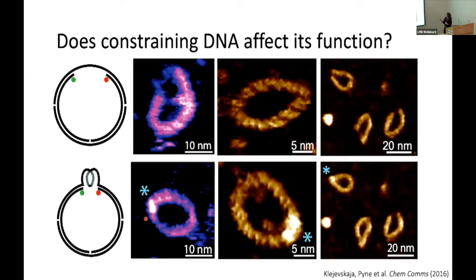But when we zoom out a little bit and look at more of a population than one, we start to see variation in these structures. So actually this one, from here to here, between these scans, which is 3 minutes, quite slow, we've seen this fold in real time. What we've been working on now is speeding up AFM. High-speed AFM exists as a field, but we're speeding up AFM whilst maintaining this level of resolution, allowing us to probe these interactions at this length scale.